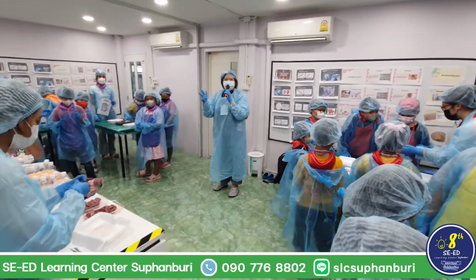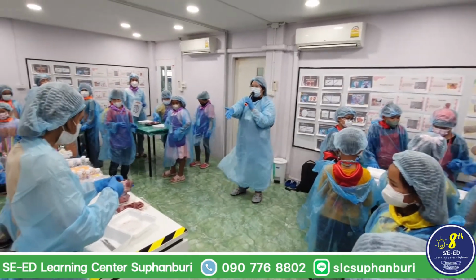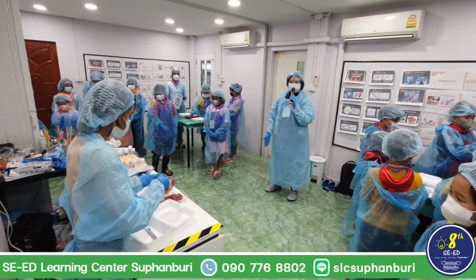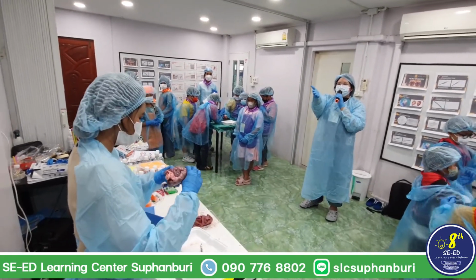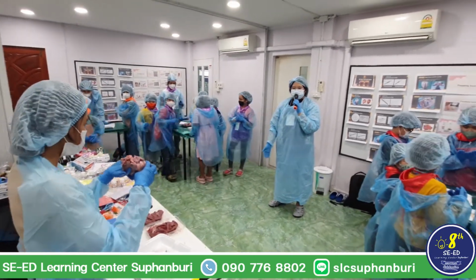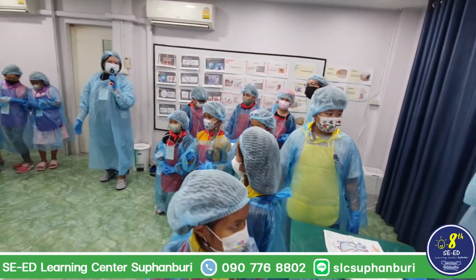The scissors keep cutting down to the bottom, like this. Okay. So then we can look inside firstly. Like this. Everybody have a look. It's going to look like this inside of the heart.